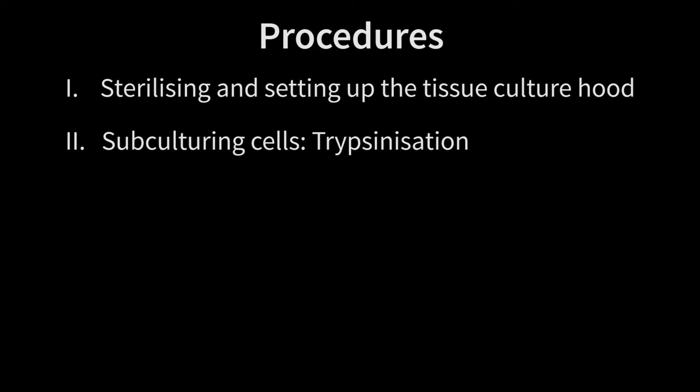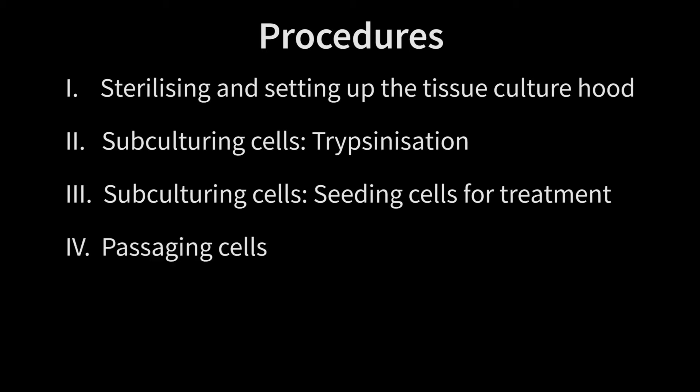In this video, I will show you how to sterilize and set up the TC culture hood, trypsinize the cells for subculture, seed cells for treatment, passage cells, and finally perform an MTS cell viability assay.